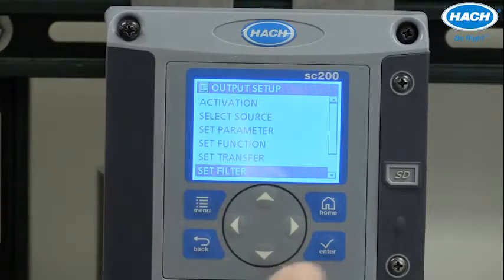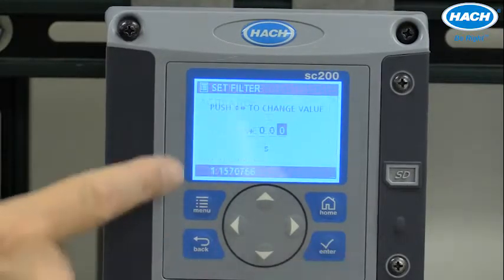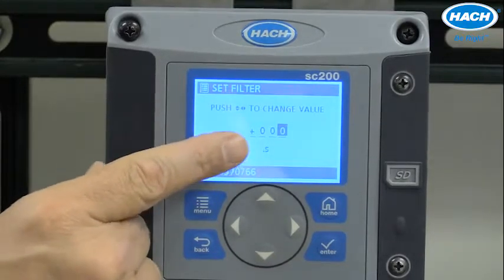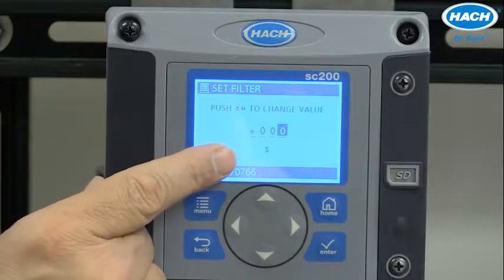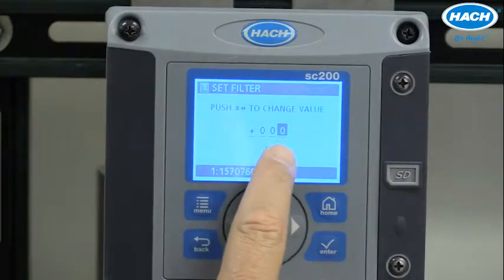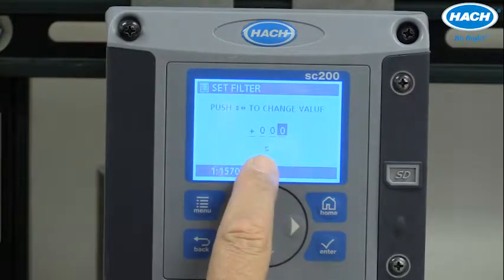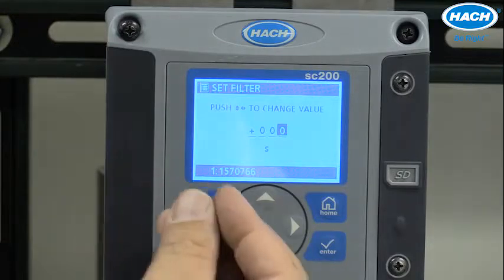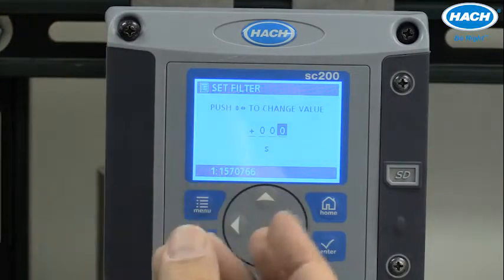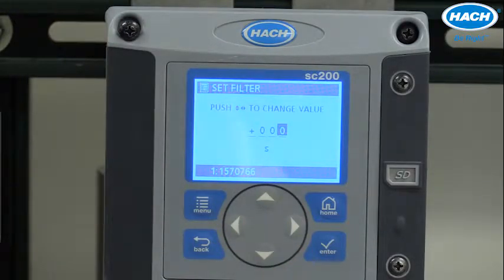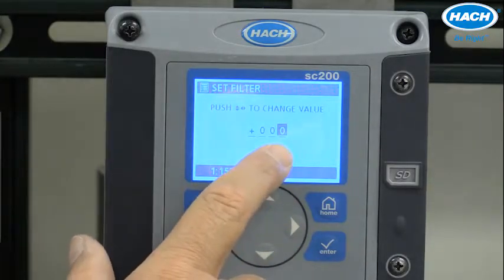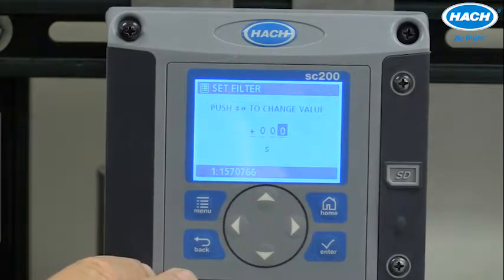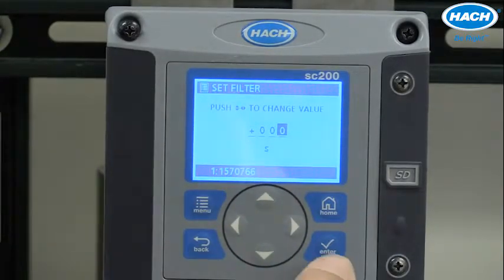Finally, Set Filter is a signal averaging or smoothing function. In this case, the default is zero seconds, but if you wanted the 4-20mA analog output to be signal-averaged to smooth its response, you could input a filter time in seconds in this particular location.